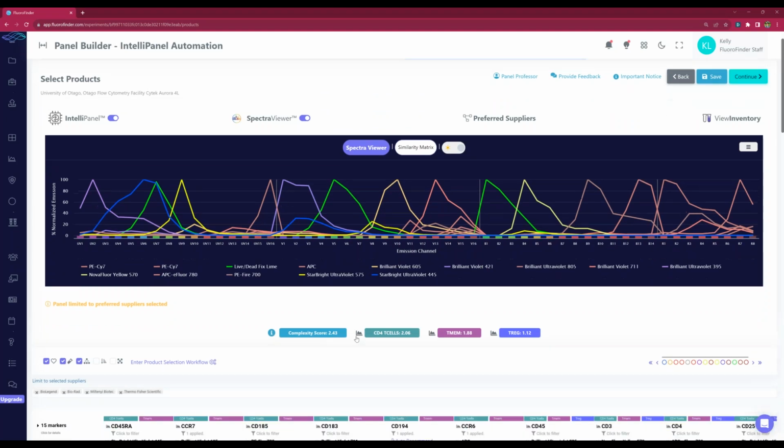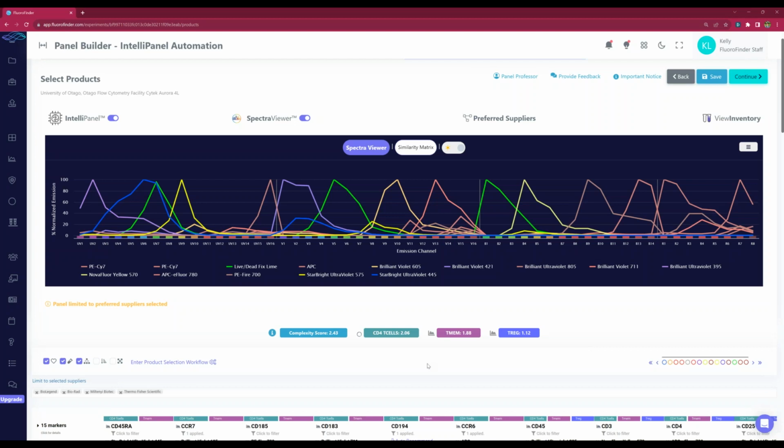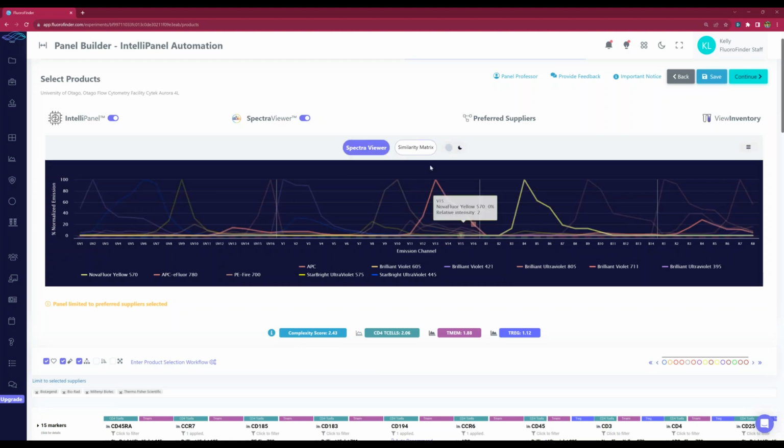One of the things that I like is if you click on these little spectra things right here, it's actually going to remove that spectra so that you can isolate maybe only one of these populations in order to see what that spillover visibly looks like. I would say this is just more for curation. I don't tend to look at spectra when I'm building panels. I kind of have already taken that into account. So I can toggle it off, or I can turn it into light mode.